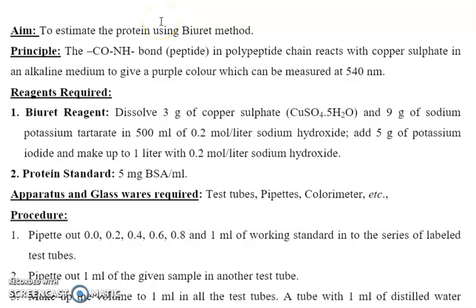Today in this video, I am going to talk about estimation of protein by the Biuret method. In this experiment, our aim is to estimate the protein using the Biuret method.